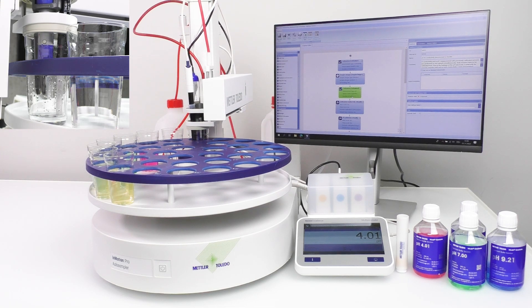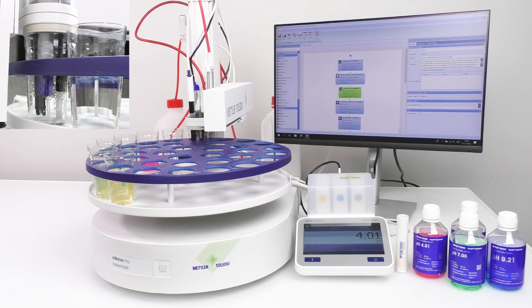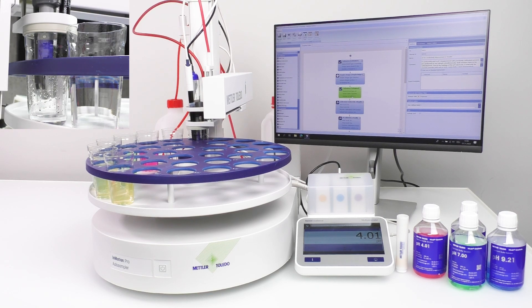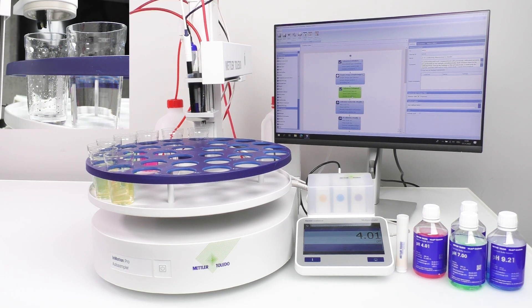Additionally, the in-motion auto-sampler offers flexibility in sensor placement height and an automatic sensor washing feature, eliminating the need for manual cleaning of the sensor between each buffer.